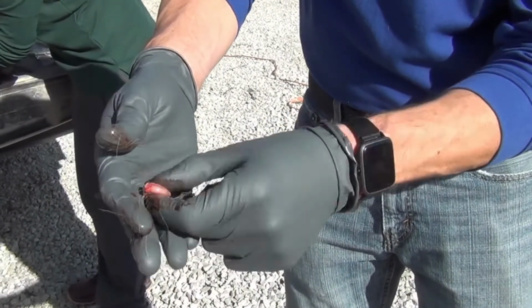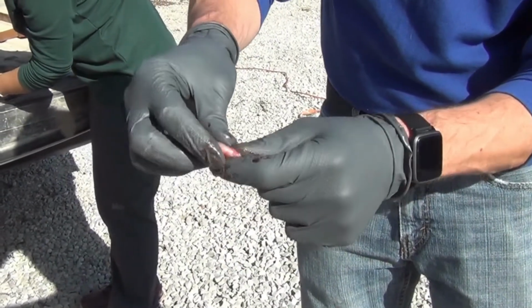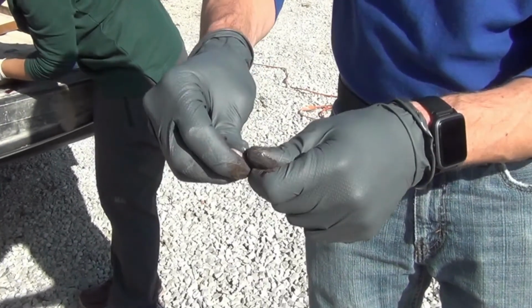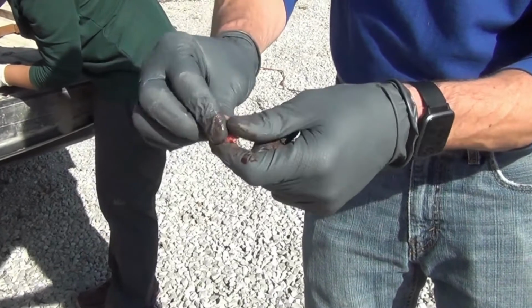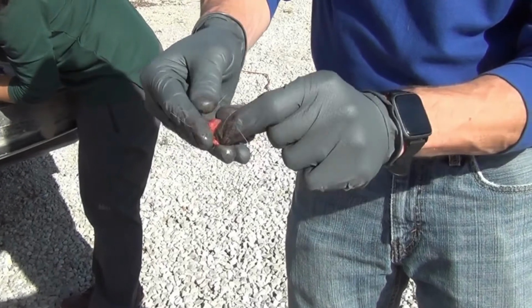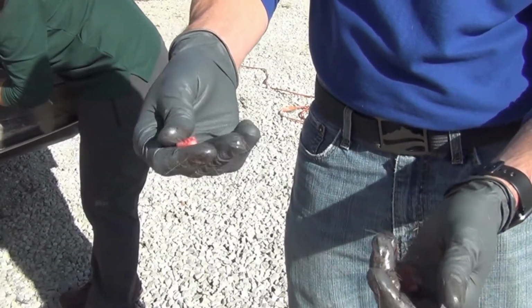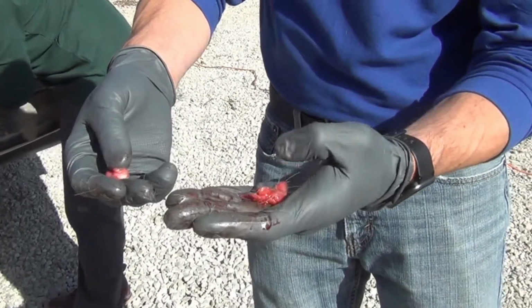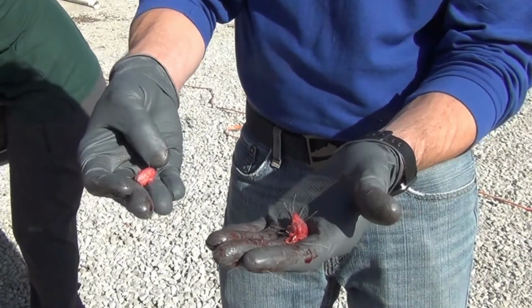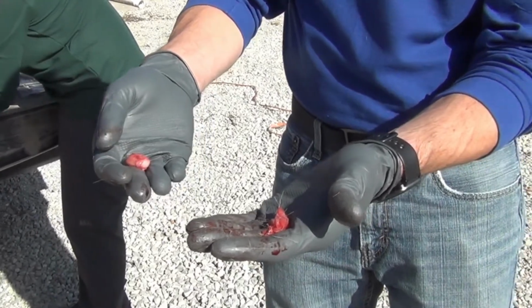If you take this lymph node that I have here, you'll notice that it's a little bit more robust in structure. If you squeeze it, it's not going to break apart. It actually feels just a lot thicker. I don't even know how to describe it, but it's a kind of solid, ball-like structure, and so you can see the differences between those two tissues. That gives you an idea of what we're looking for when we're looking for the tissues that we're sampling.